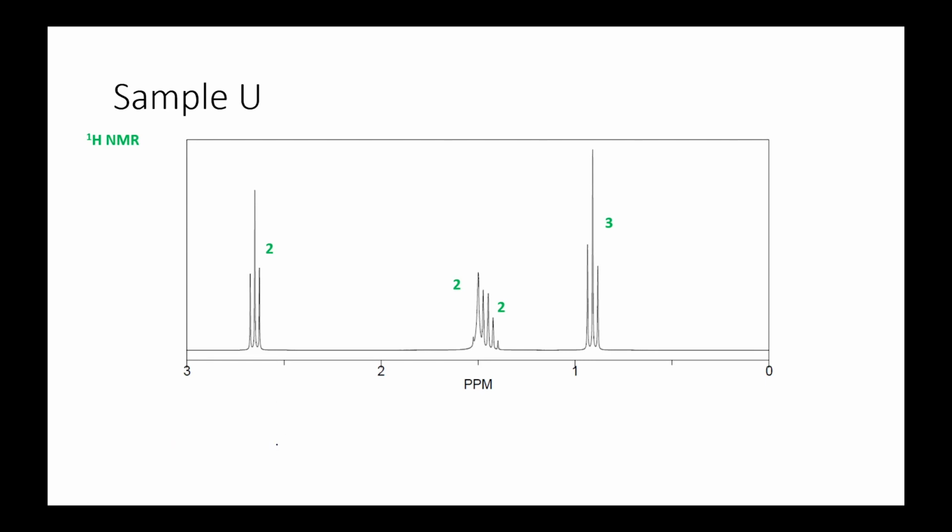The first thing I do when I come to my proton NMR is to draw in my carbon backbone. So we know that we have 3 carbons. And then the next thing I do is I always look at the bottom half of the region in the proton NMR. So that's below 1, because very often we see this signal here, which integrates for 3 protons and is a triplet.